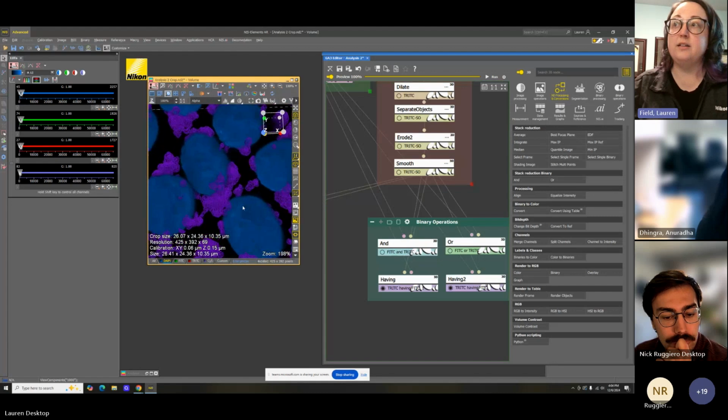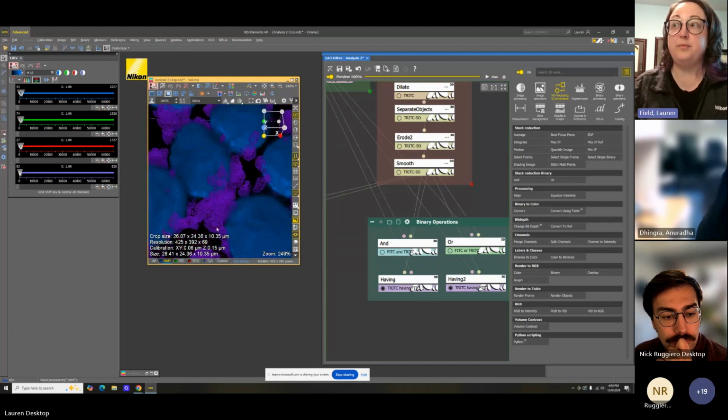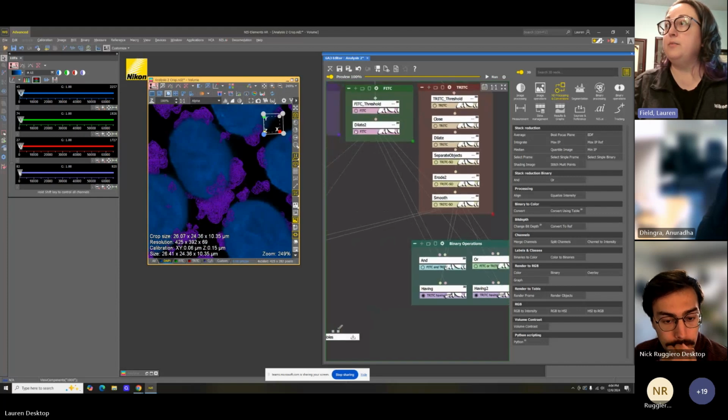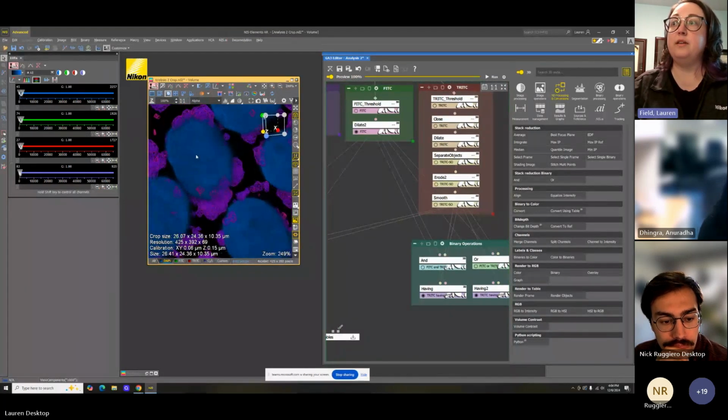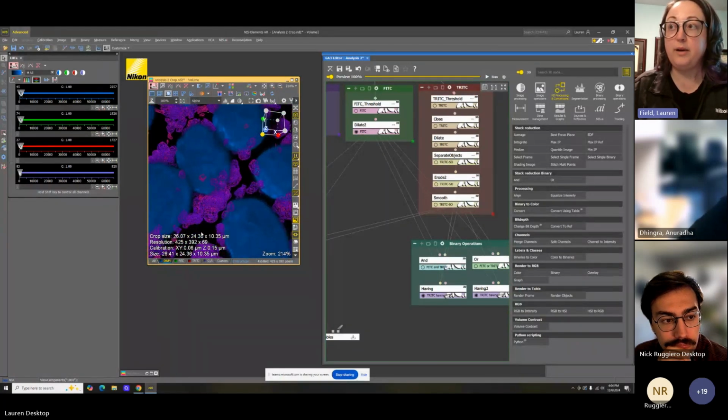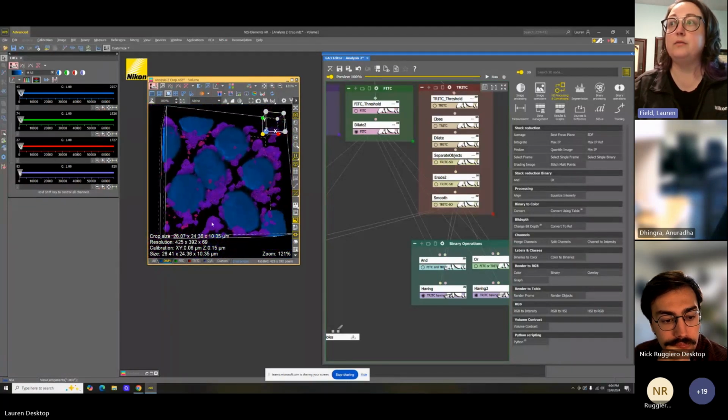And you can see they are different sizes and different shapes. This should match up with items that we have in pink in volume. And you'll see that we have some inside of this structure render that just didn't have any of our yellow binary in them.